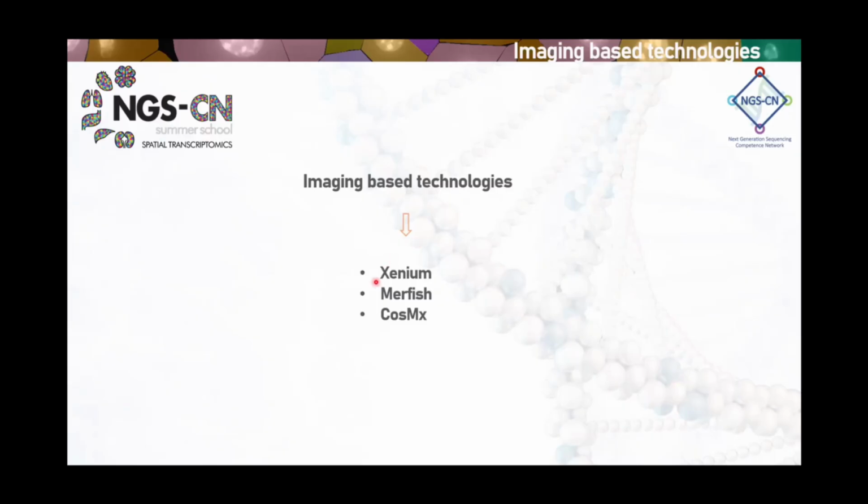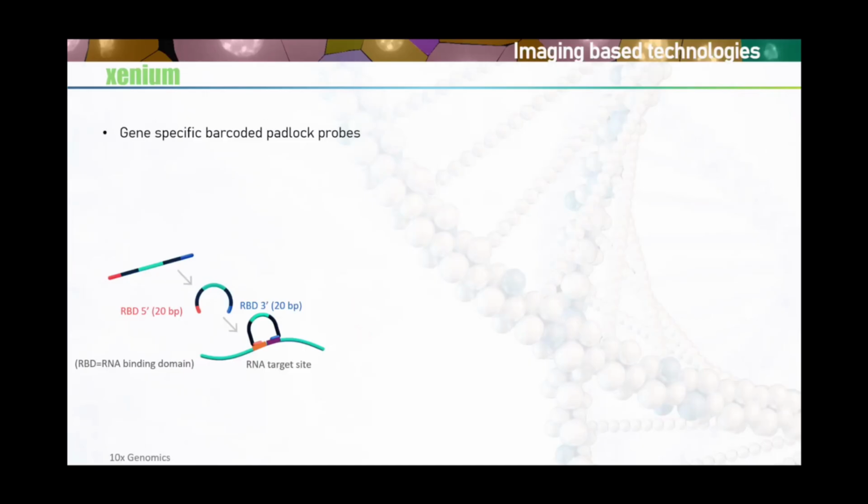Now, as I said, the way they amplify the signal will be different for each of the technologies. So I will explain this. I will go through these 3 technologies, but the same as sequencing based, there are even more out there and more coming. The field is growing very quickly right now. So I will start with Xenium.